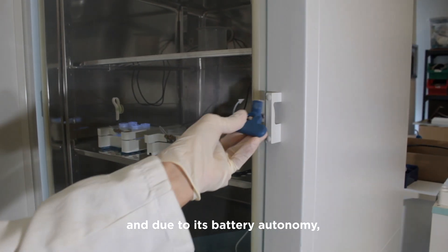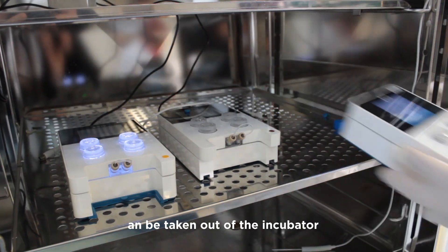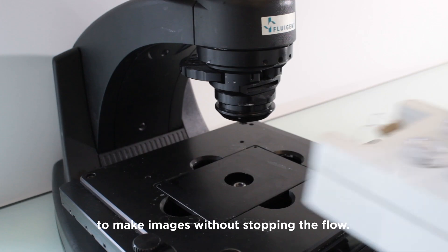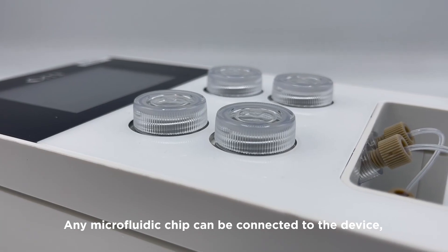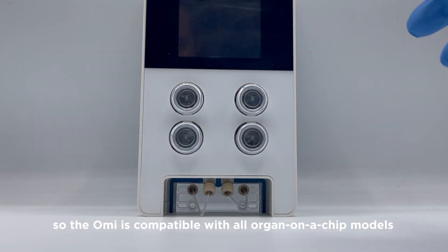The OMI is compactly designed to fit on any size stage, and due to its battery autonomy, can be taken out of the incubator and placed under a microscope to make images without stopping the flow. Any microfluidic chip can be connected to the device, so the OMI is compatible with all organ-on-a-chip models.